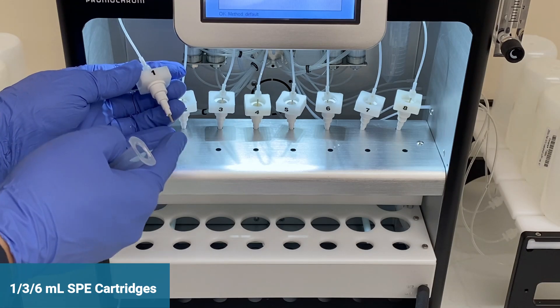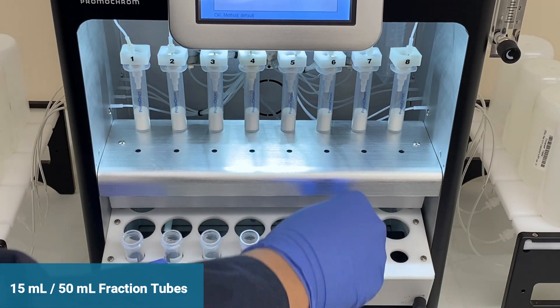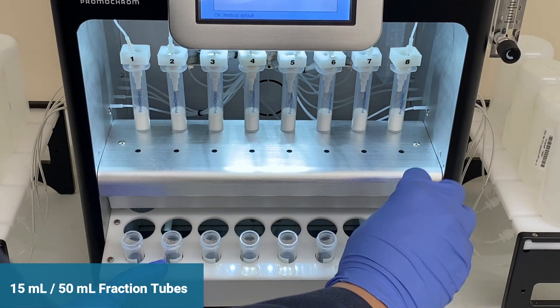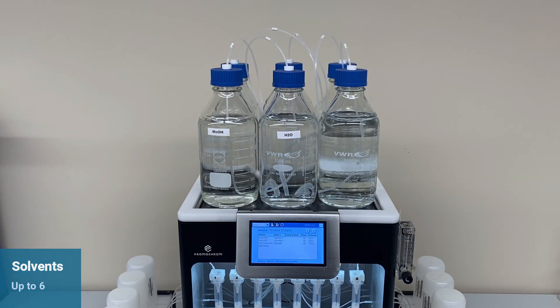Connect any common 1, 3, or 6-milliliter SPE cartridges to the system, and load 15-milliliter or 50-milliliter fraction tubes in the fraction collection tray. Solvent and sample wastes can be separated using the two waste outlets. EPA Method 537 uses only two solvents, but you can have up to six solvents on the SPE03.